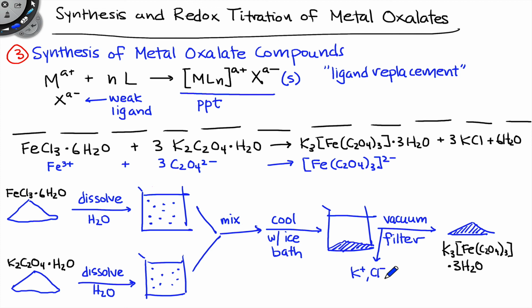What we're interested in with this synthesis is essentially how well we did relative to theoretical expectations. And we quantify that using what's called the percent yield. How much did we get relative to our expectation based on the amounts of reactants we used? This calculation hinges on which of the 2 reactants, way back when we weighed out the solids, is the limiting reactant. So you'll need to figure that out based on the amounts that you weighed and the stoichiometry of the reaction, the 1 to 3 stoichiometry that's shown here.